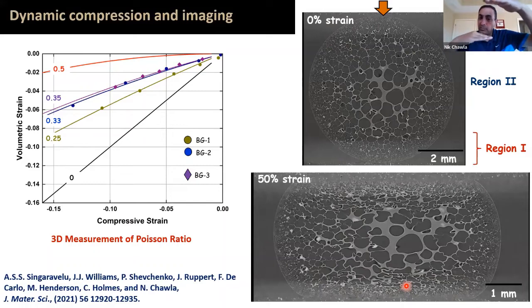And most of this is taking place at the outside of the bead. And what's interesting is that the interior of the bead is actually quite stable and does not undergo a lot of deformation. So most of this is actually localized and gives you a lot of that nice response when you're walking or running with these shoes.